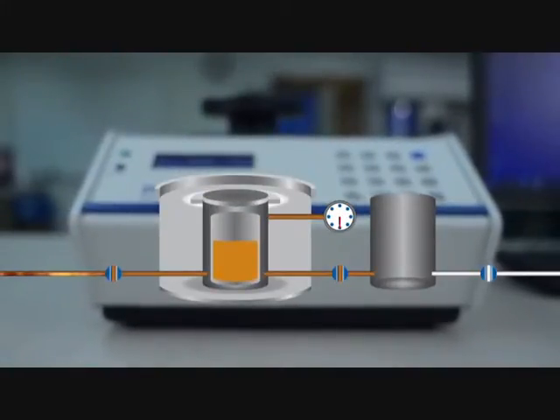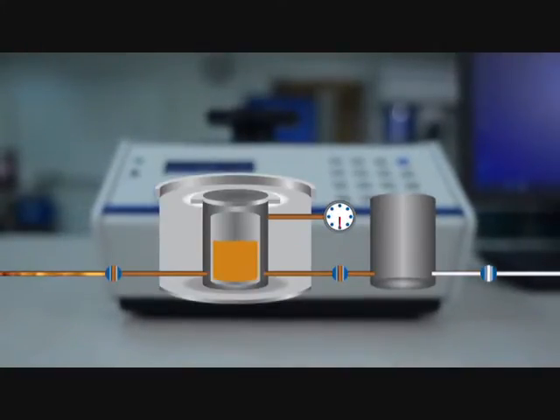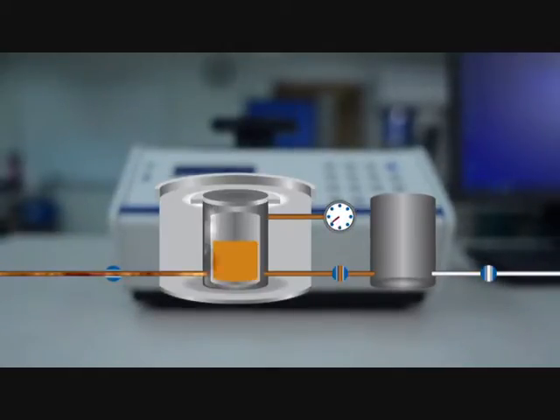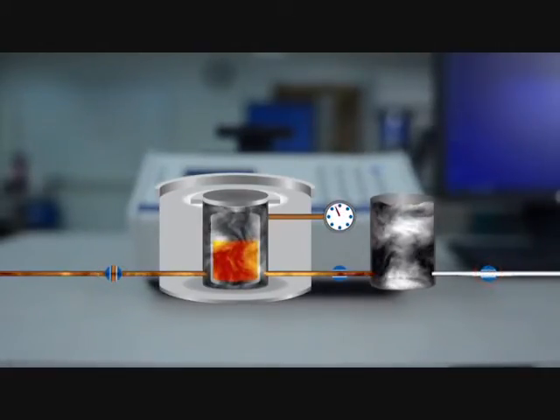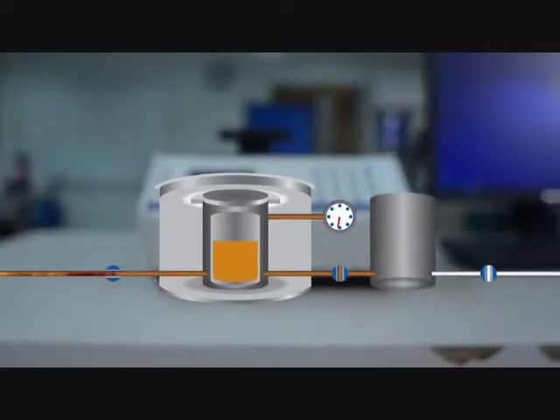We are going to pressurize the sample chamber with gas from a helium or nitrogen tank set to 22 pounds per square inch of pressure. To purge the system, open the fill valve and then the expansion valve. Then vent the gas out of the unit. Before analyzing, we purge the system using this process.